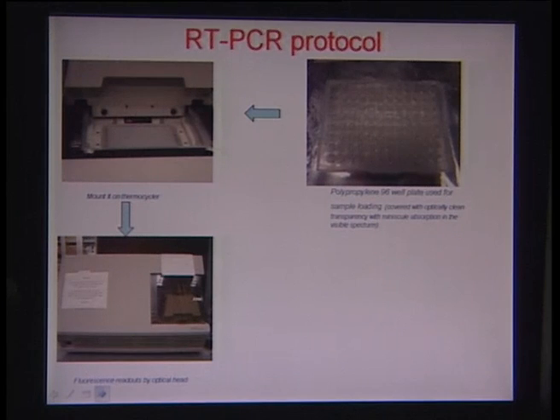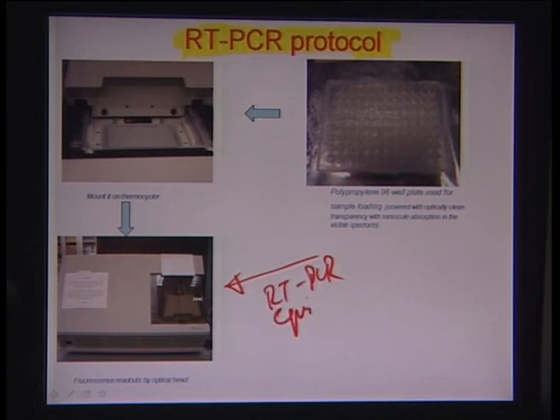Normally we do need to read out the fluorescence signal very quickly, and for that, especially in the RT-PCR or Q-PCR reactions, we do have a separate reader unit. So essentially there are two aspects here. One is that there has to be a reader head. You can see this is essentially equipment from Stratagene. This is the RT-PCR equipment, and this right here is also the fluorescence readout mechanism.